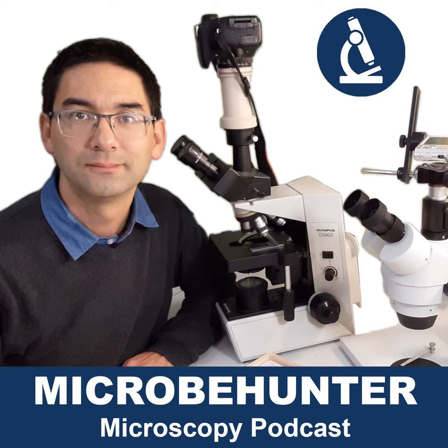Some objectives have a spring loaded front part, and this means that the front part retracts. So this is a protective mechanism. But still, if you continue to rotate the coarse focus knob, then you're actually going to do some damage. So mistake number 4.